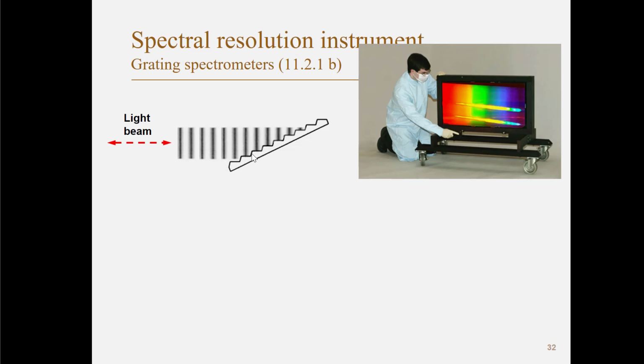But the light diffracted from the next one, compared to the light diffracted from the one before, has traveled half a wavelength down and then another half a wavelength back. So it has traveled exactly one wavelength longer in this direction, going back in exactly the opposite direction to the incoming beam. And since they differ by exactly one wavelength, these two interfere constructively in this direction because they have exactly the same phase in this direction.